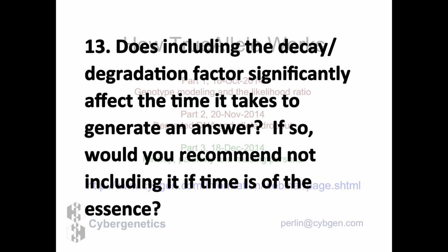It's also true that in studies that we and some of the user labs have done, most of the time, maybe 95% of the time, you're done with the TrueAllele results on a mixture in a few hours, running maybe only 5,000 cycles. So I would have to say that most of the time you wouldn't bother with it on most of the data that you have, and you would just get results on your 2- and 3-person mixtures pretty quickly and leave it at that.